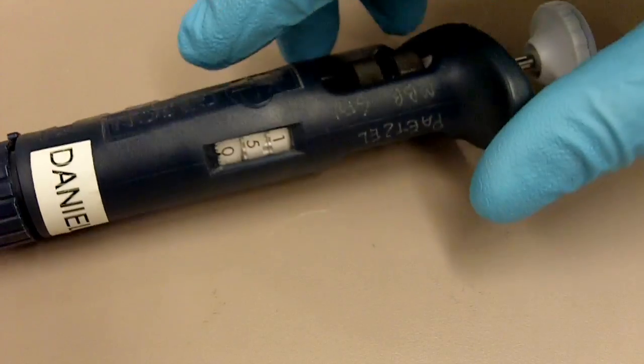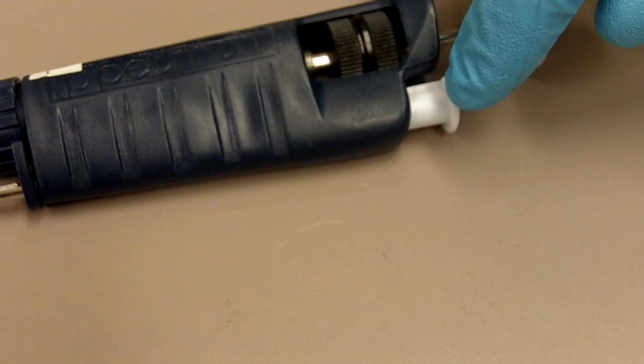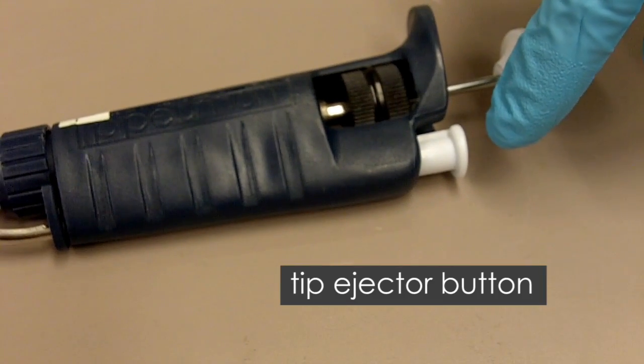And if we go to the back of the pipette, you'll see one button that's here. This button is the tip ejector button.